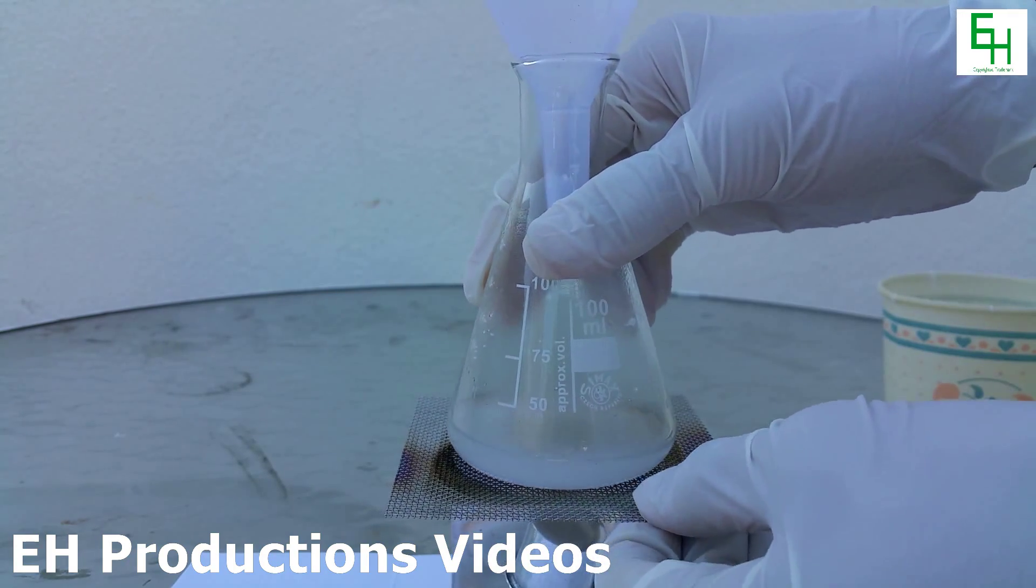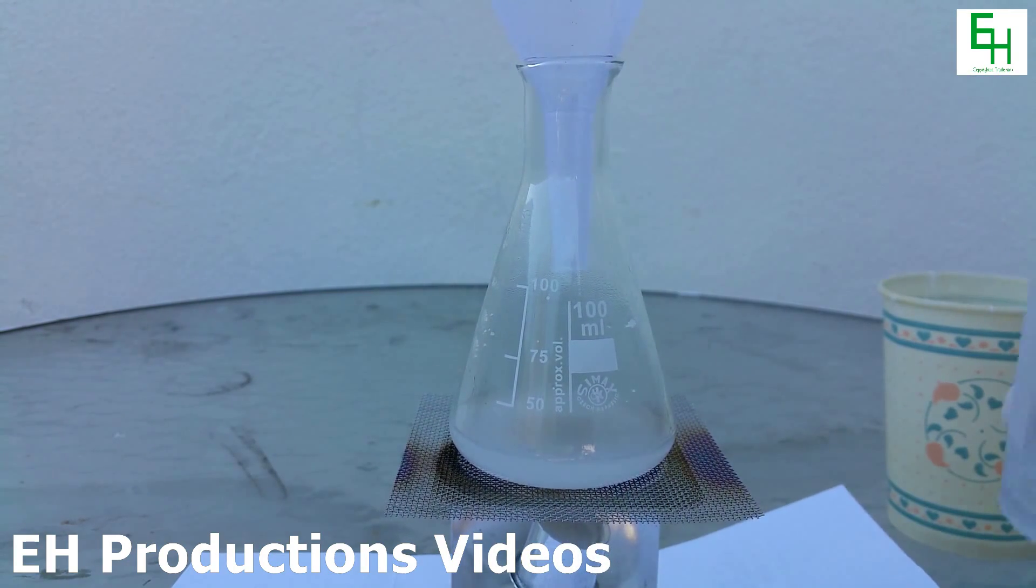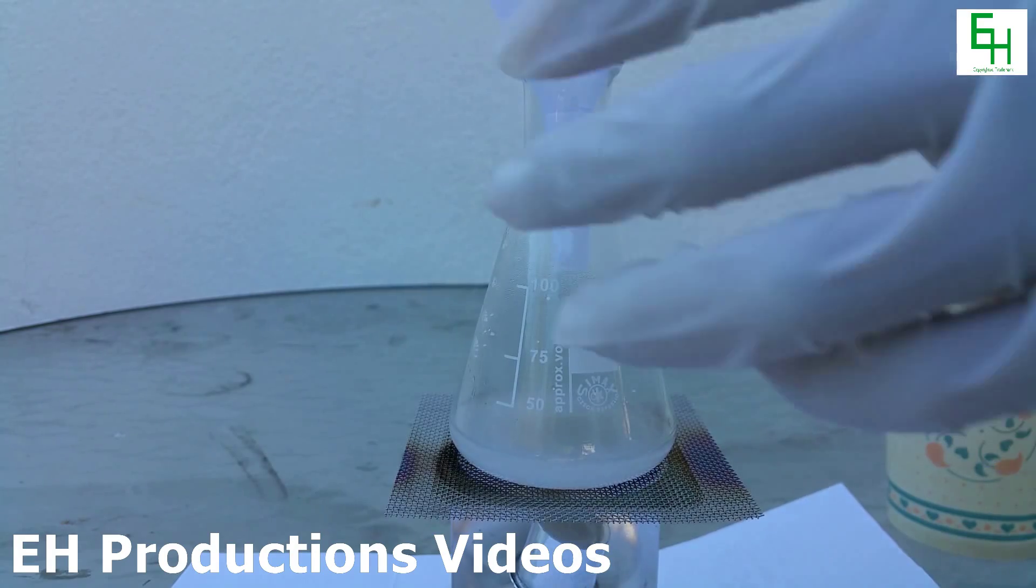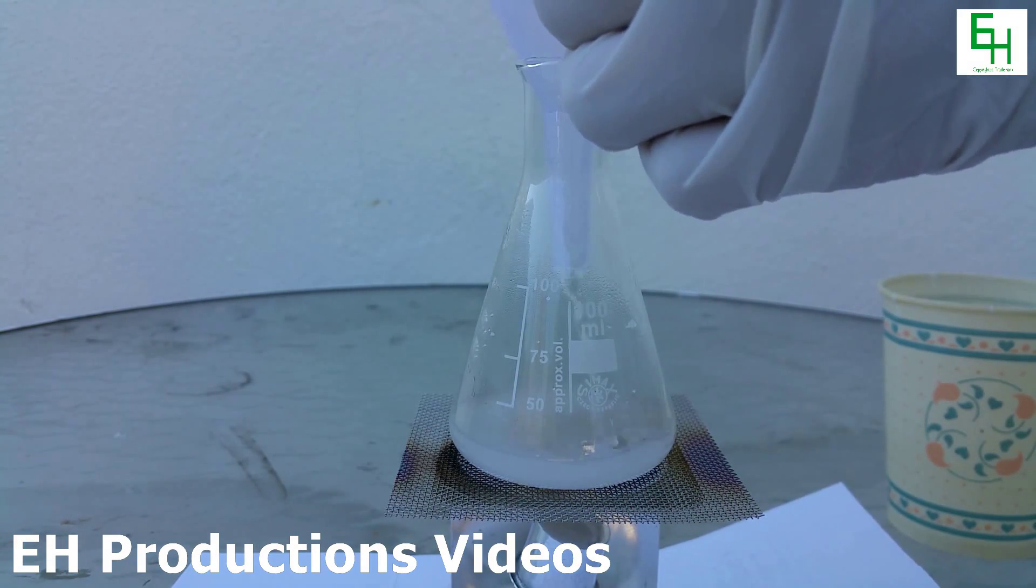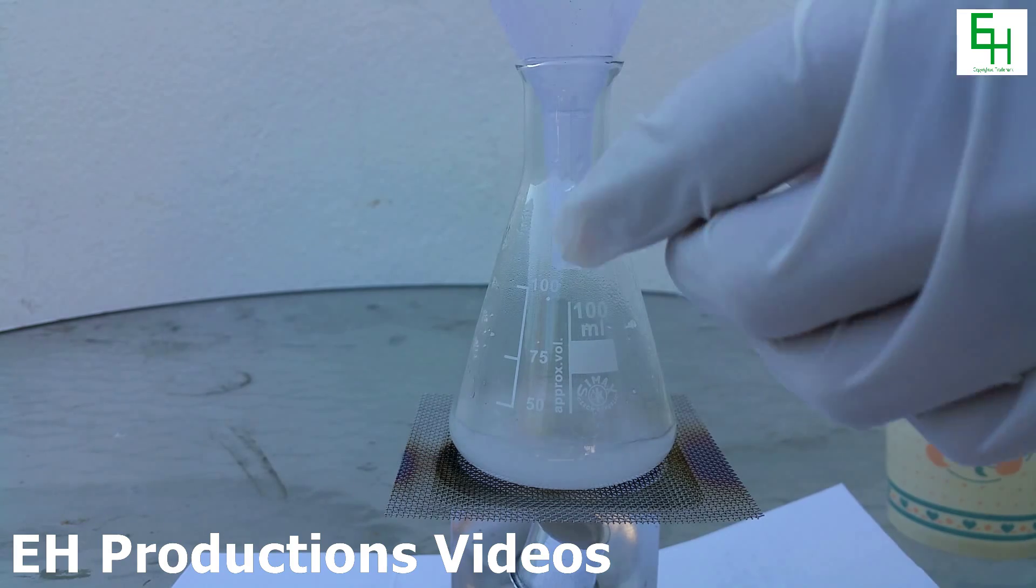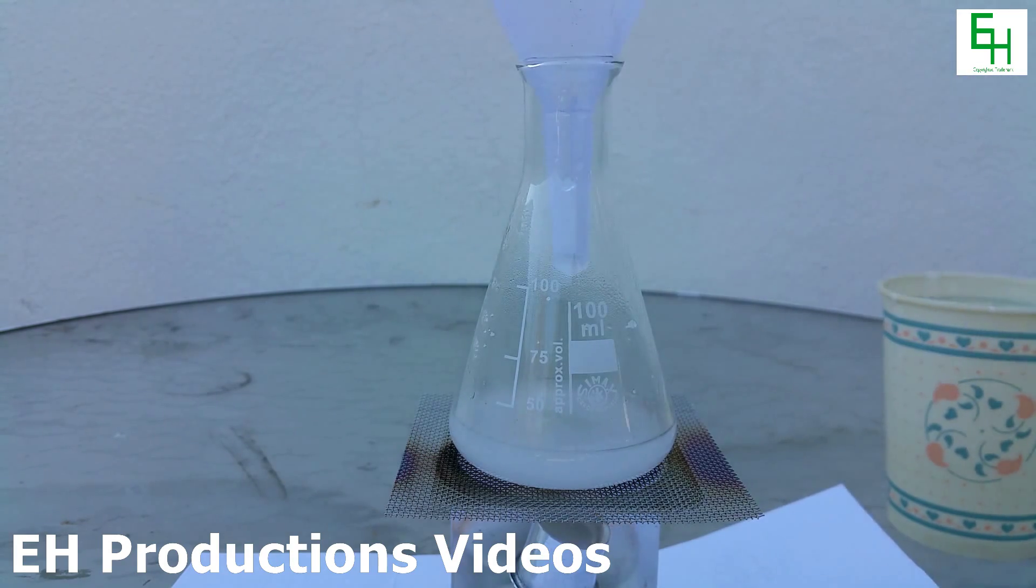The water is already really hot and now we're going to use the remaining 10 milliliters of water to wash the rest of the sodium hydroxide that might have stuck on the funnel.